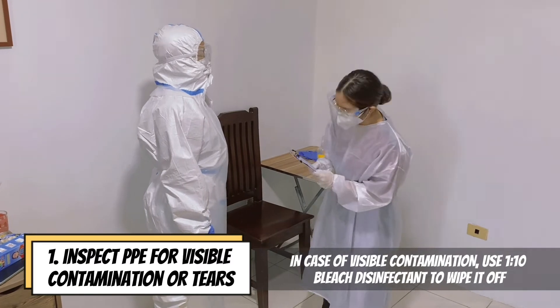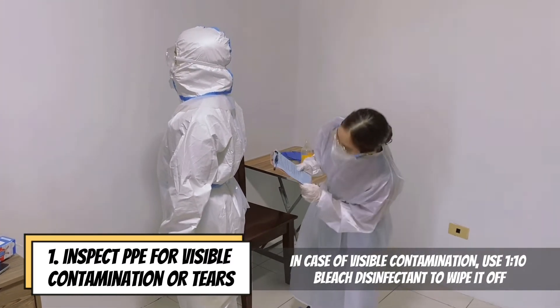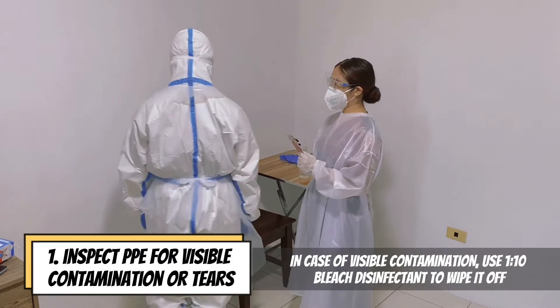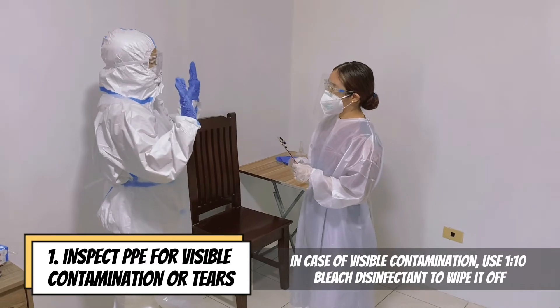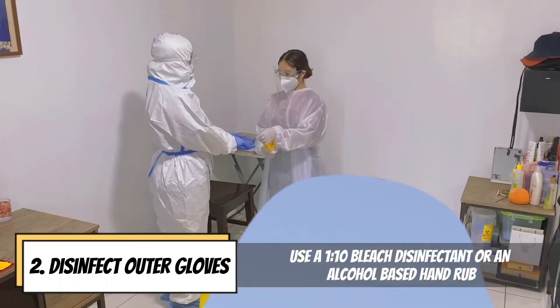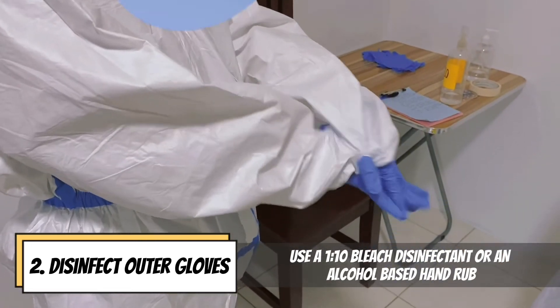If contact with the healthcare worker is made, the trained observer should immediately disinfect the outer glove hands with alcohol-based hand rub or 1-to-10 bleach solution. Inspect PPE for visible contamination or tears; in case of visible contamination, use 1-to-10 bleach disinfectant to wipe it off. Disinfect outer gloves using a 1-to-10 bleach disinfectant or an alcohol-based hand rub.